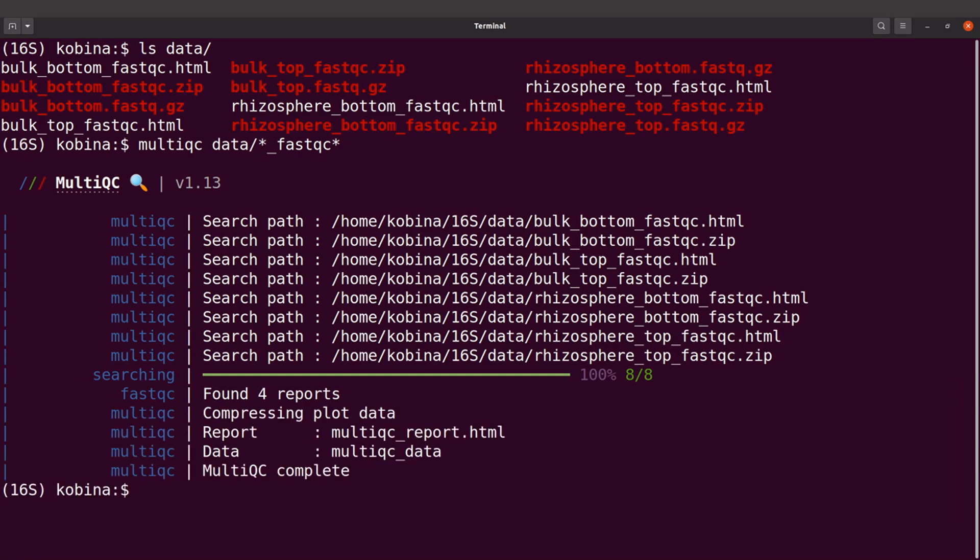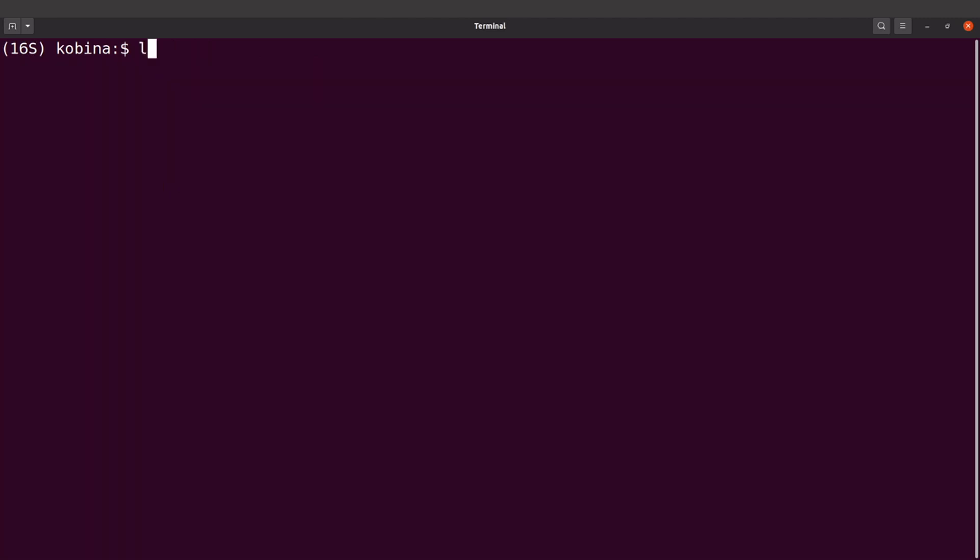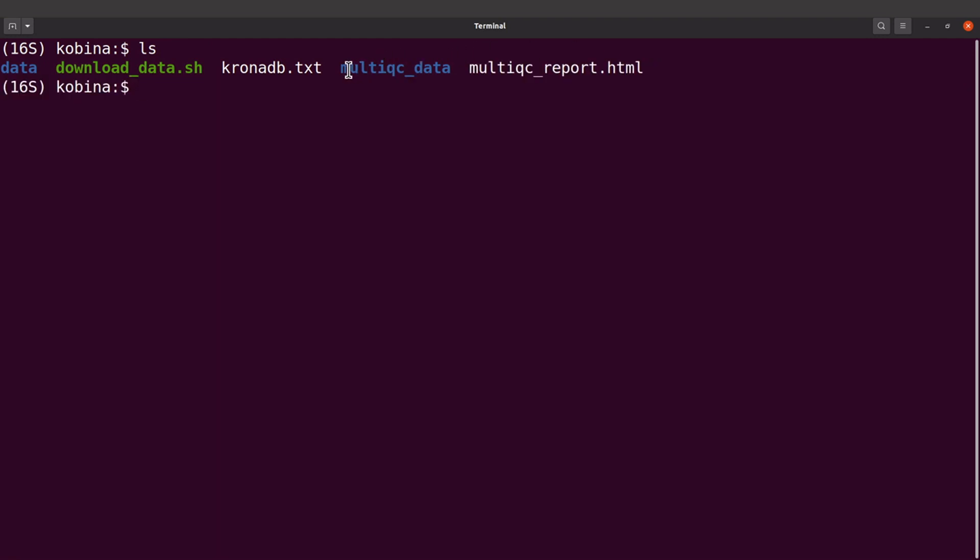We have that done. It says it has found four reports and has aggregated all of them. We can find the output. Let's do an ls and we're going to find this HTML file and this directory. We're going to view this one here which has all the reports. Let's do that using our browser.